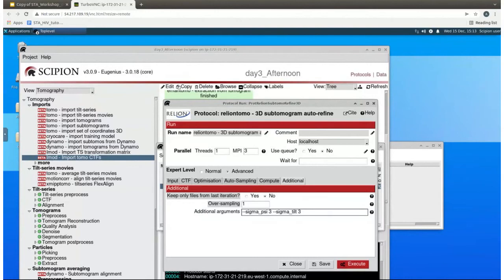For the rest, did more or less everyone manage to launch the auto refine? If I already started a set of refinement with another subset, I shouldn't start another one, right? Because I could overwhelm the machine. It depends if you have already one that has finished, because you just got one GPU. So you can just run one at a time.